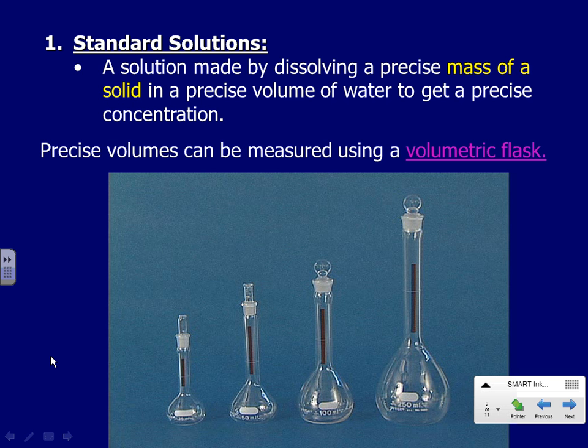Now, a standard solution is a solution where we've taken great care to measure our solid, trying to eliminate as many errors as possible, making sure the scale is functioning properly, making sure that we have the proper type of weigh paper so that nothing sticks to it, or maybe an aluminum boat.